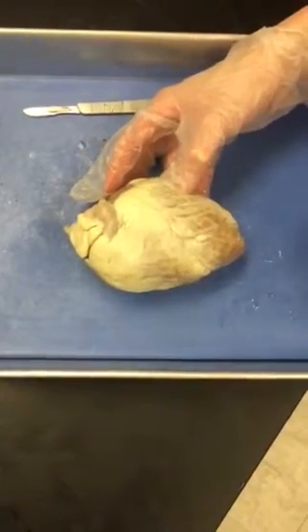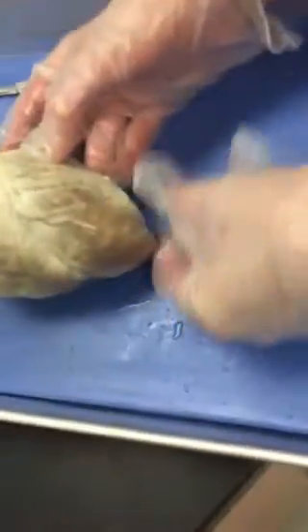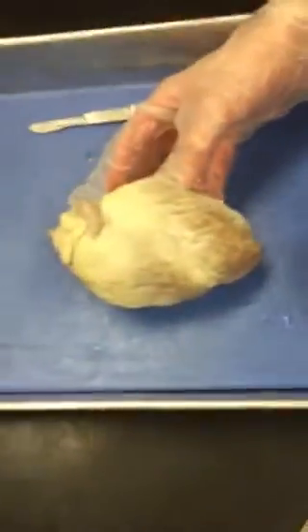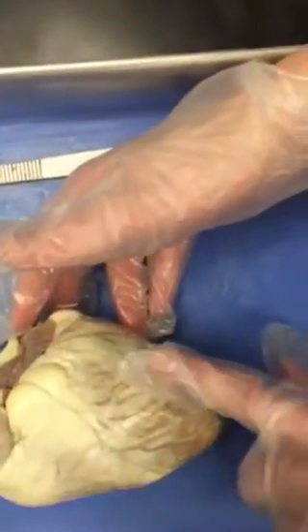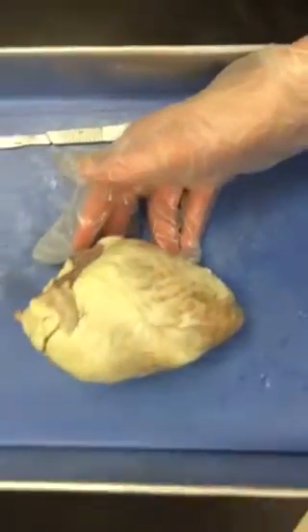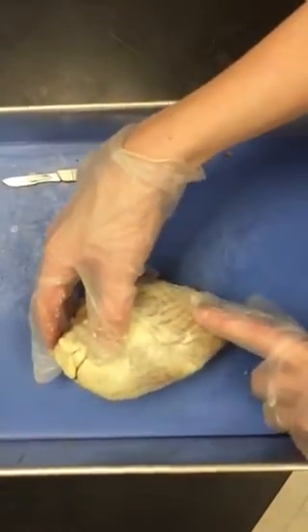Number nine, note that the bottom of the heart comes to a point called the apex. Number 10, to the right and above the apex is the left ventricle. Remember, it is left because of the presentation. 11, use your finger to push on the outside wall of the left ventricle and notice the firmness of the chamber.